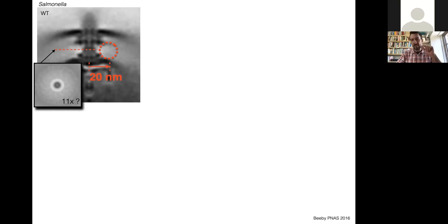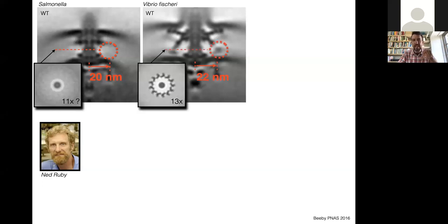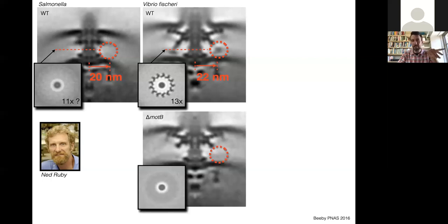There's indirect evidence from biophysicists around the world that there are 11 stator complexes in the Salmonella flagellar motor. We moved on then to the Vibrio fischeri flagellar motors. When we examined it in more detail with our collaborator Ned Ruby, we saw that the C-ring is slightly wider. On top of that, we do see densities where we would expect to see the stator complexes. We thought that these 13-fold symmetries were probably the stator complexes. So we asked Ned to delete those components and we re-imaged them. Indeed, those structures are gone. So we conclude that the Vibrio motor has a slightly wider C-ring and slightly more stator complexes than Salmonella.